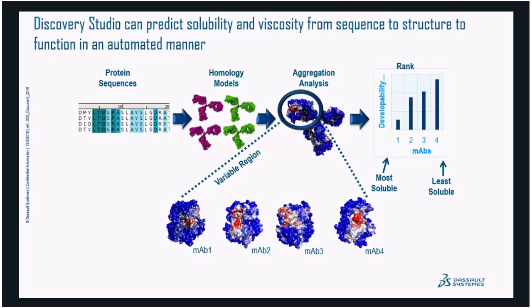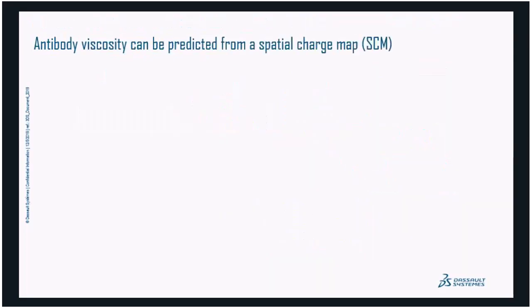And it's important to know that while this protocol was really geared towards and focused around biotherapeutics and antibodies, if you're not interested in biologics, this could be extended to proteins in general. So I just wanted to make that clear.